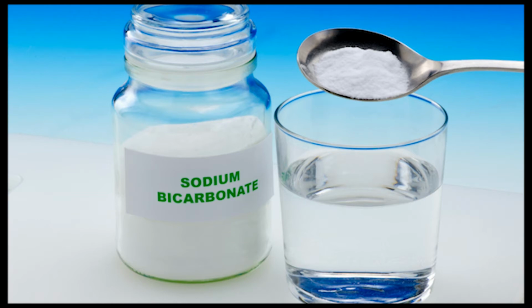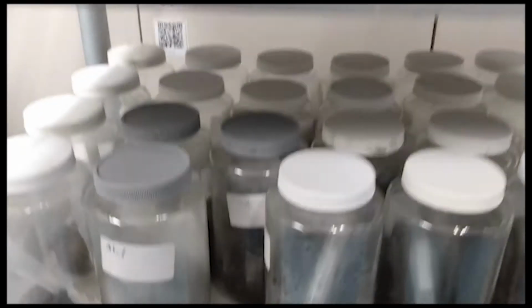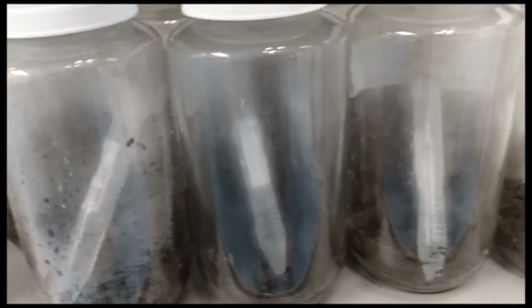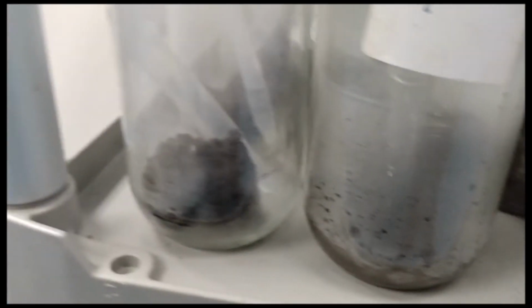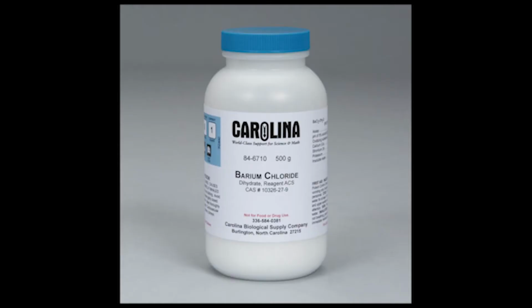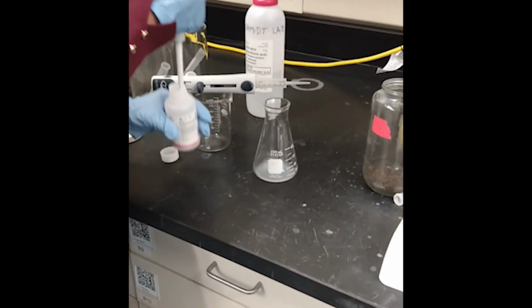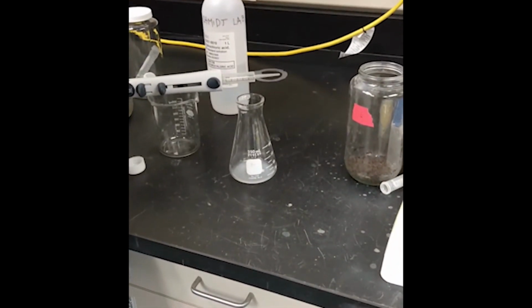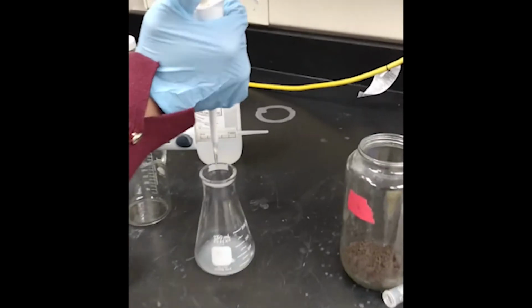So then, after 24 hours, we'll take that new solution where all the carbon dioxide that was released as gas has been trapped within this solution, and we can use acid-base reactions to determine how much carbon dioxide was trapped there. There'll be an intermediate chemical reaction to precipitate out some of the material and leave the solution more or less basic, depending on how much carbon dioxide was initially trapped in the solution.